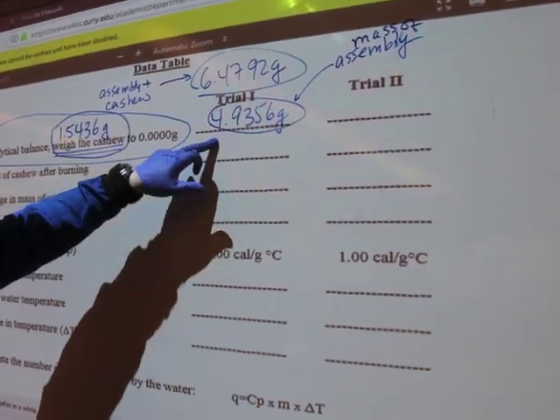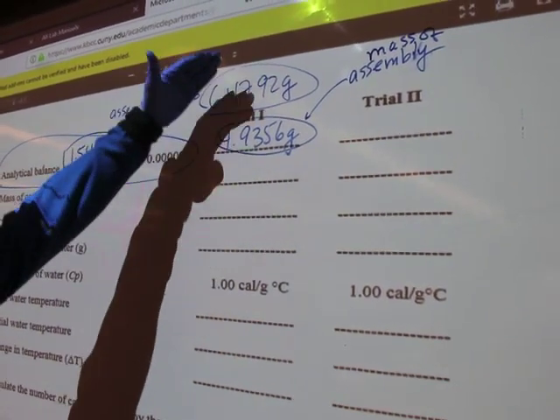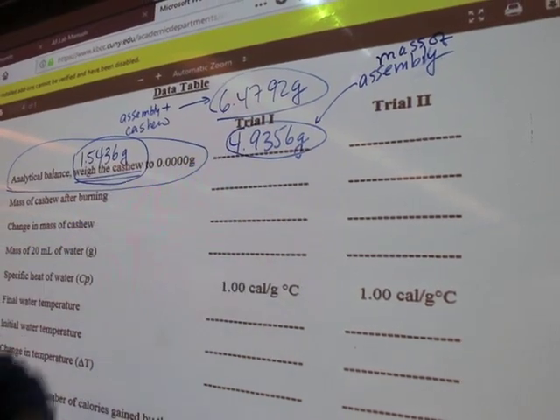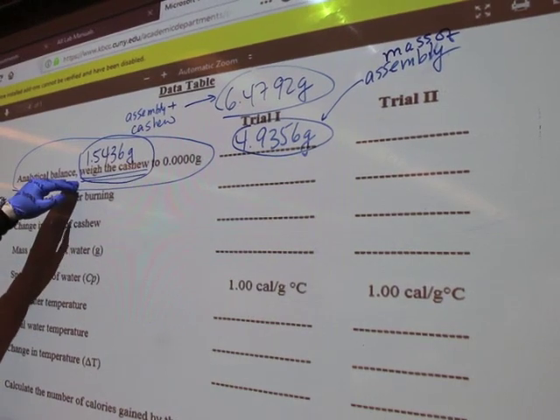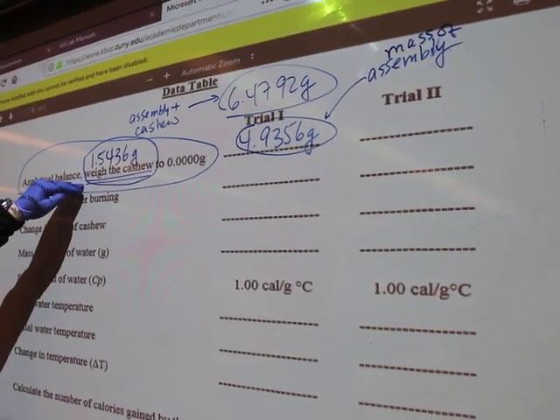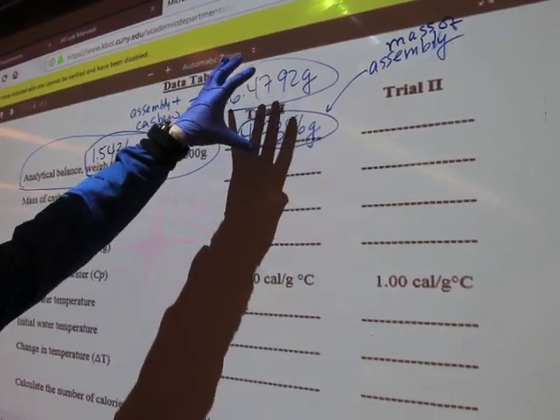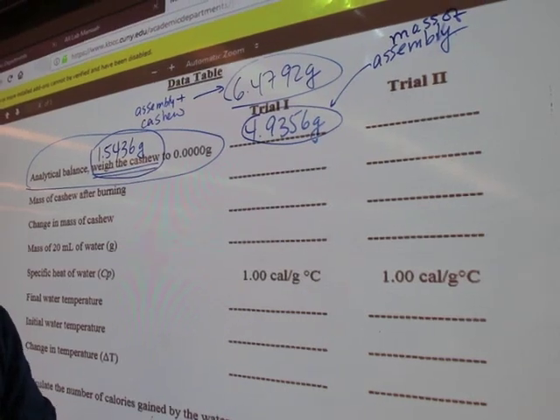I measured the assembly plus the cashew at 6.4792 grams. I determined the weight of the assembly by itself, so the difference between the two gives me the mass of the cashew, because there was no space to put both masses.